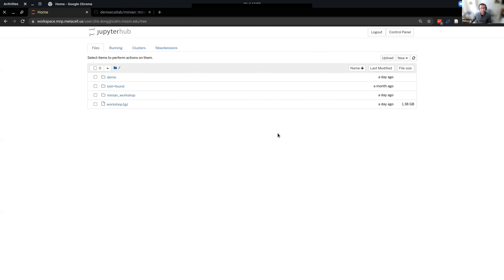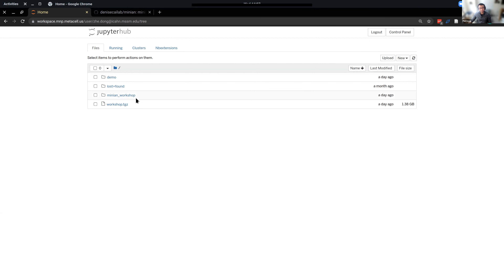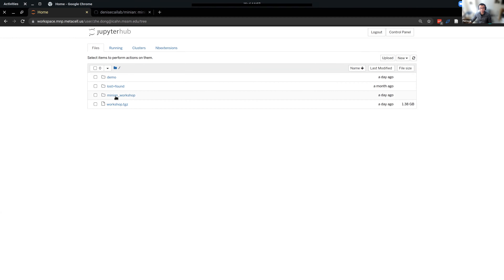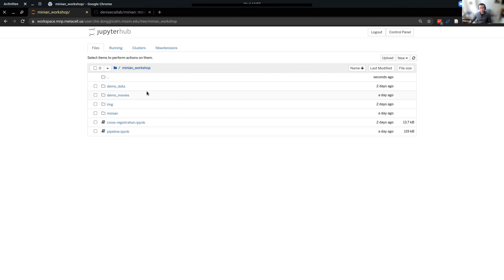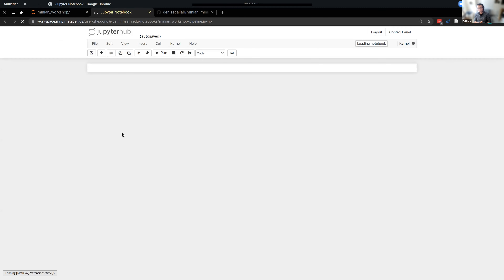I'm going to go ahead and share my screen so we can start. Can everyone see my screen? Good. So everyone should be able to see something similar to my screen — this Jupyter notebook interface. I have a few more files here, but the most important folder is the minian workshop folder. If everyone can log onto the cloud and go into this folder, there is a notebook called pipeline. We're going to click on that and start.